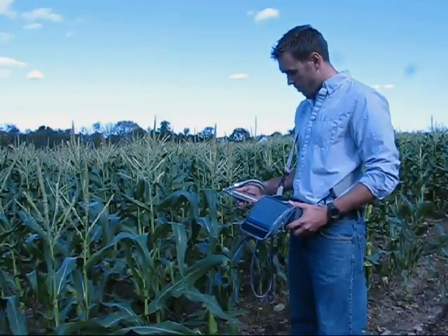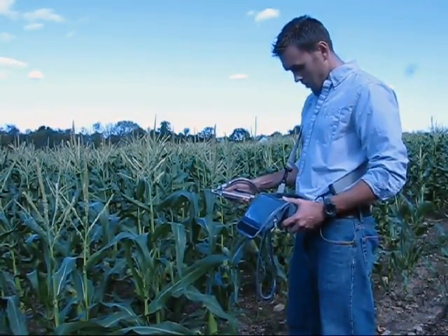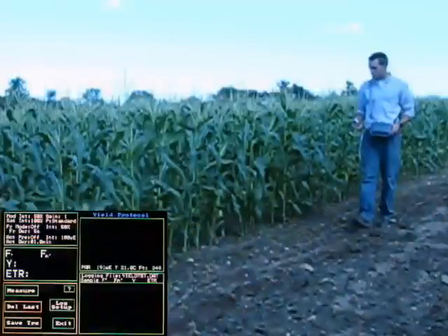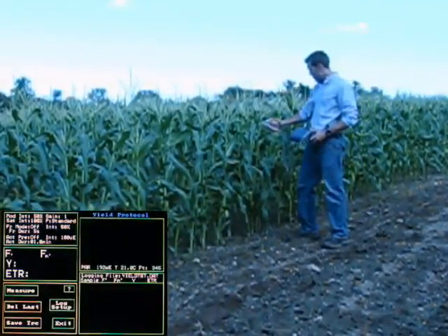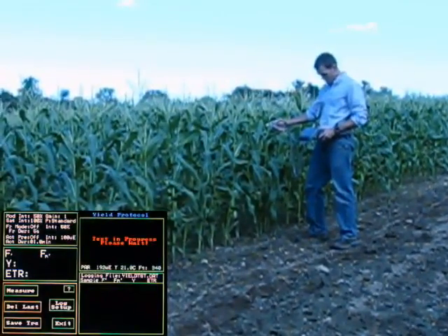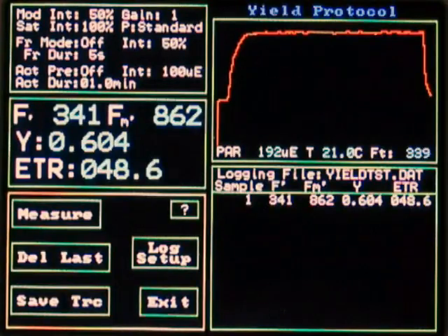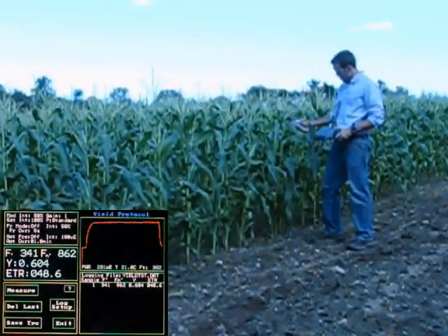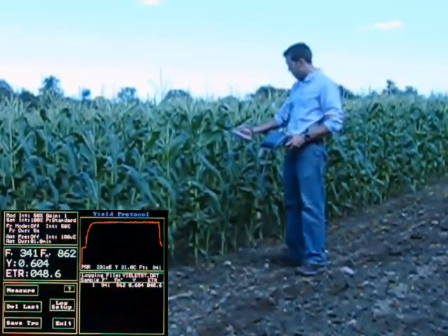Here, the quantum yield of PS2 is being measured using the OS-1P and a PAR clip. As shown earlier, when measuring yield, one can see the results, the trace, and previous measurements all on the same screen.